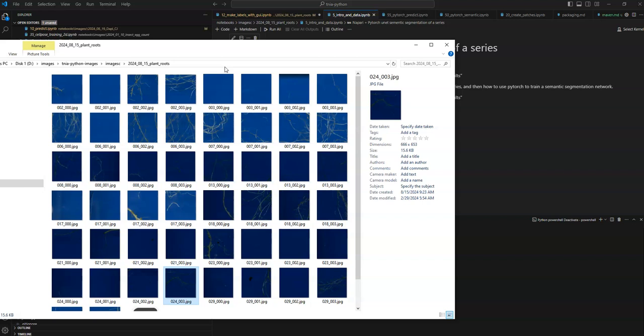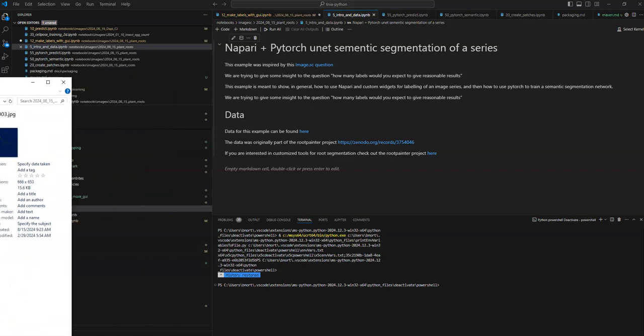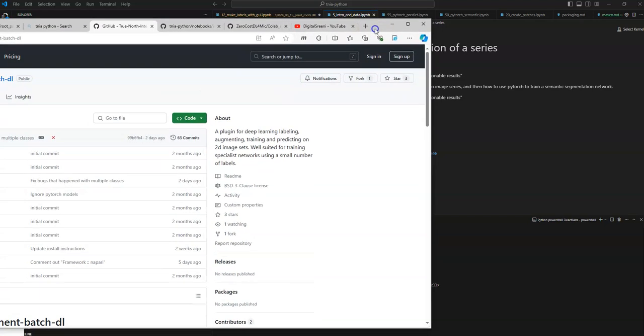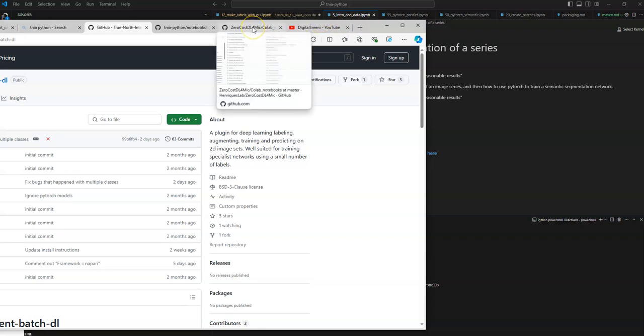And what you're looking at here is a collection of plant roots. So sometimes it's cracks, sometimes it's vessels, sometimes it's roots. A few questions, and it's one question that over the last few months nobody's really provided great solutions. So if you're interested in semantic segmentation, and that's segmentation when you're dividing, classifying an image into background pixels and one or more foreground classes.